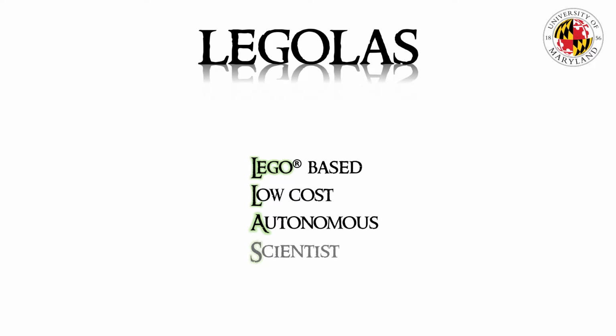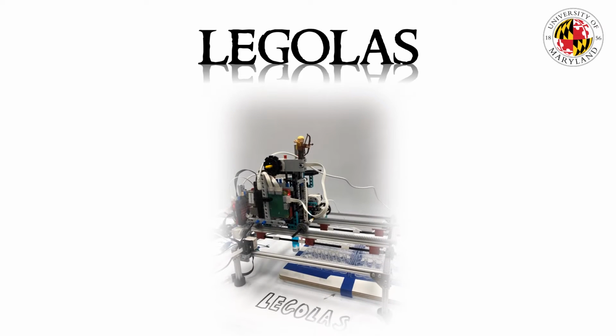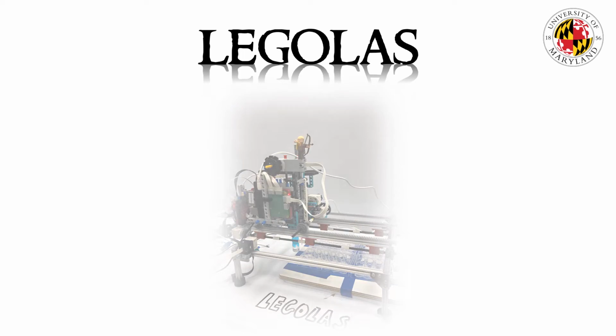Hello and welcome to the LEGOLAS system. LEGOLAS stands for the Lego-based, low-cost, autonomous scientist, and we'll talk about what this is. Here's a picture at first of the LEGOLAS system.